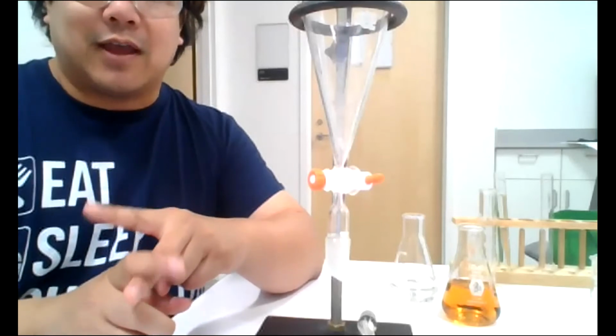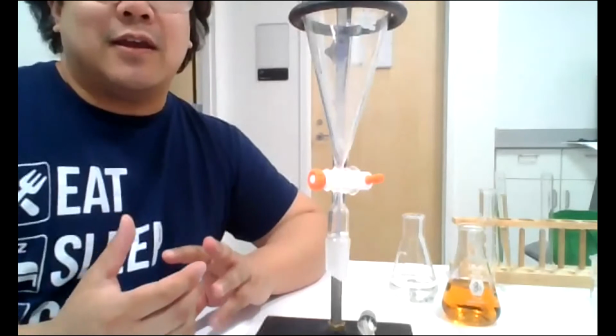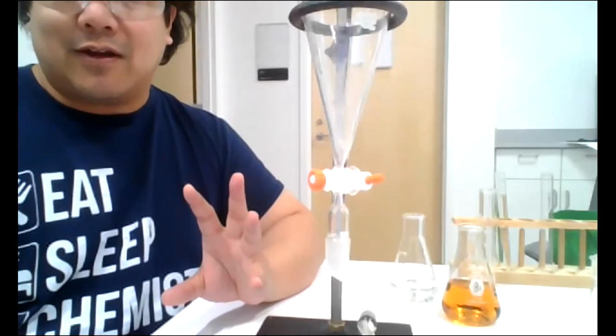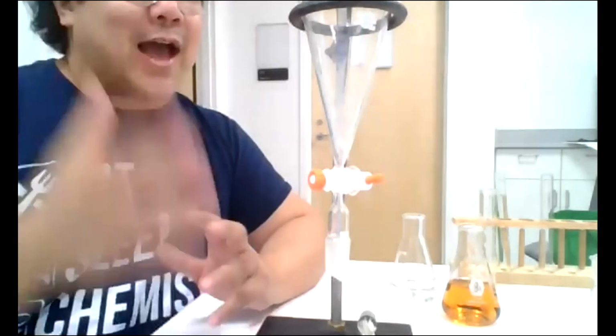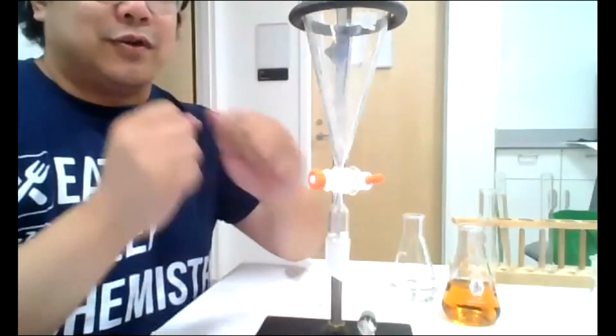Okay? It's almost like when you're washing your clothes, and you have that dirty laundry water. You rinse it once, and then you drain everything, okay? And then you add more pure water, and then you drain that. So same thing here. You're not adding 2 servings at the same time. You're adding 1 serving, do your washing.